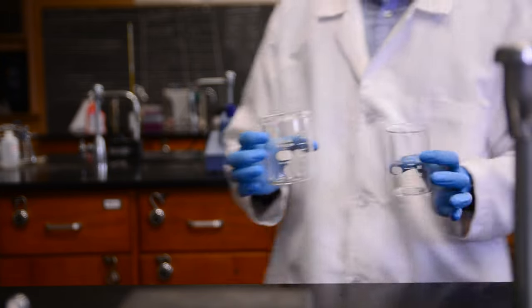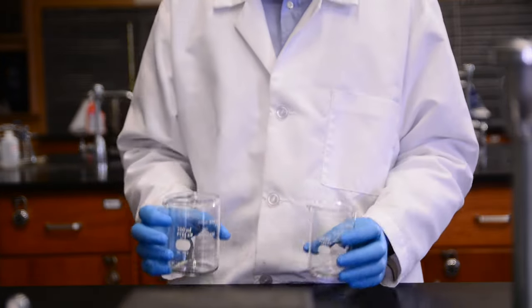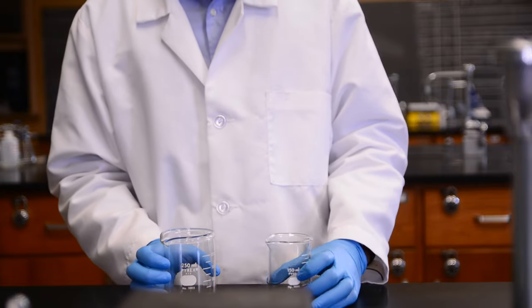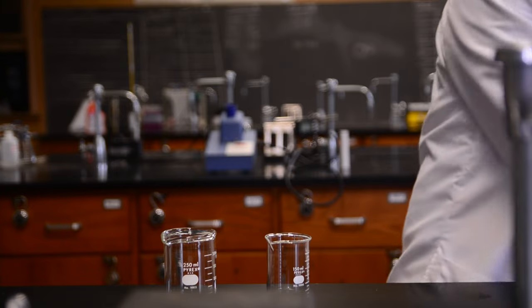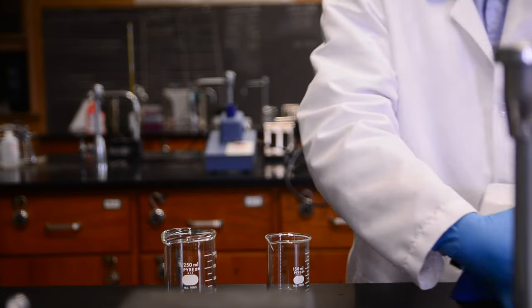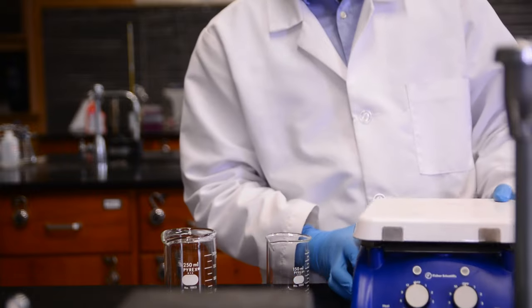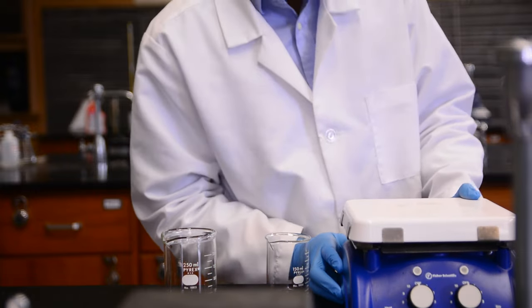To carry out a recrystallization, we will need a few materials. First, we will need two beakers. We will use a 250ml and a 150ml beaker in this experiment. Then we will need a hot plate with a magnetic stirrer, or a Bunsen burner if a hot plate is not available.